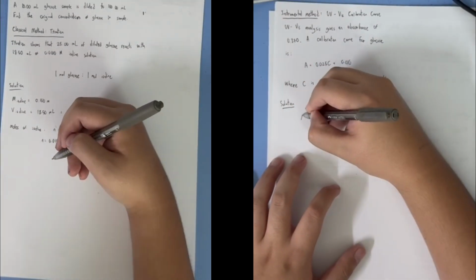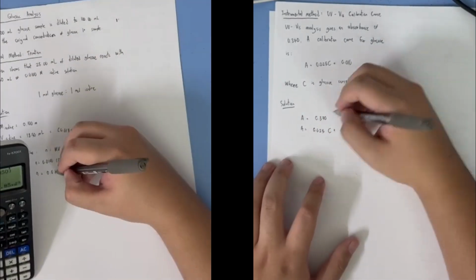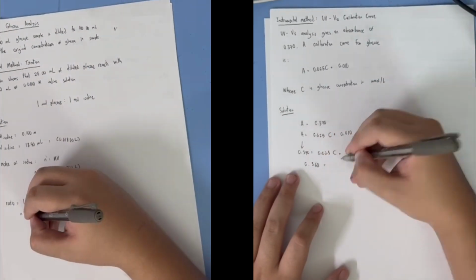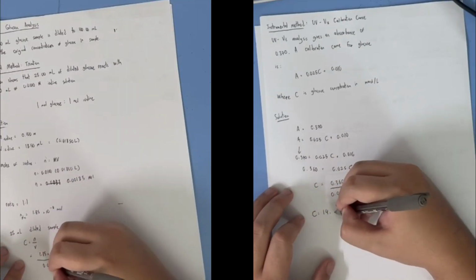And while I have your attention, I am now showing a live demonstration and calculation using both classical and instrumental methods, those being titration and calibration curve, both on the same problem to show the difference in the accuracy and speed of both methods.